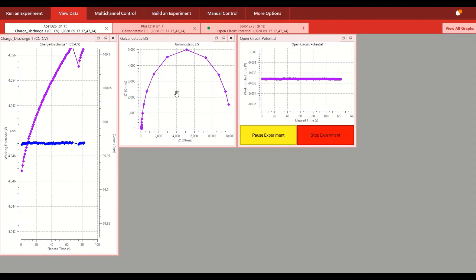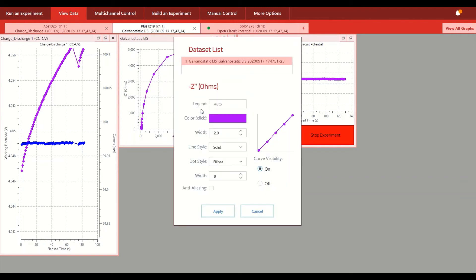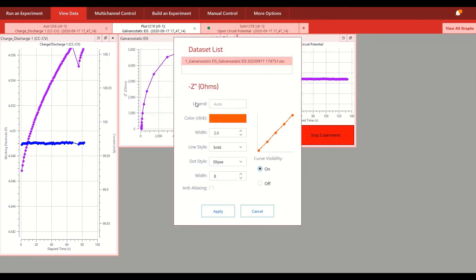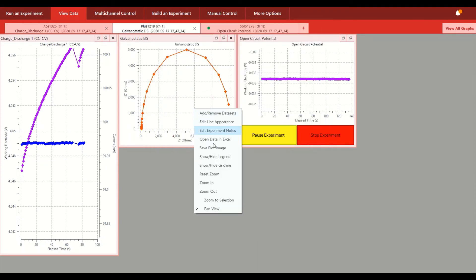And you can access all the same graph options by right-clicking the screen to, for example, edit the line appearance and to do other sort of graphical manipulations.